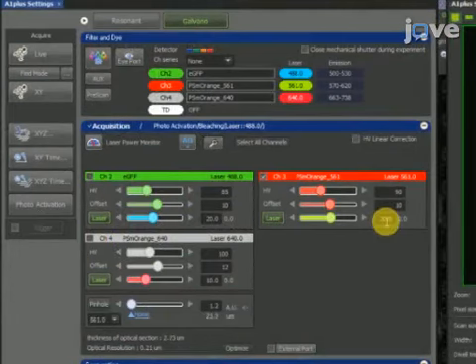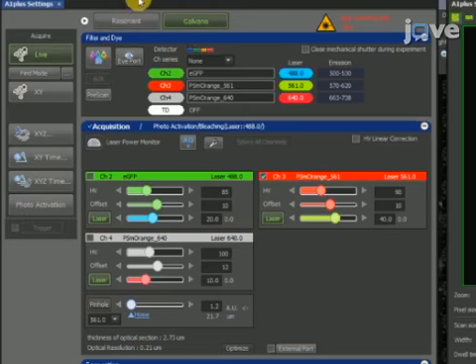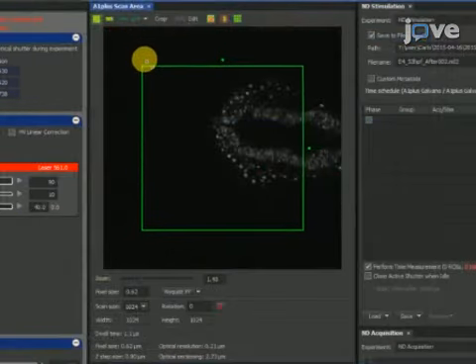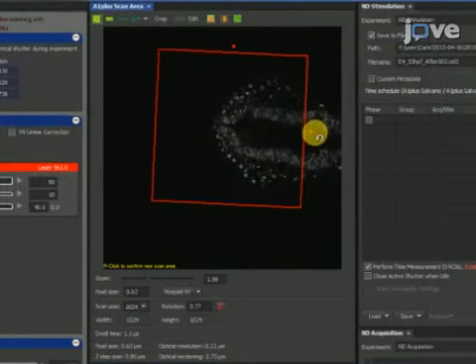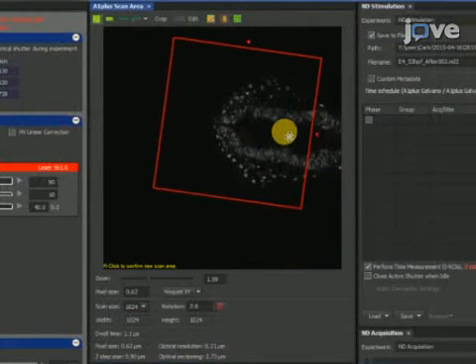To detect the PSmOrange protein before photoconversion, use the 561 nanometer laser at 0.74 milliwatts of power measured at the focus plane above the objective and adjust the laser power as necessary. Adjust the zoom factors to highlight the area of interest and reduce image acquisition time and phototoxicity.